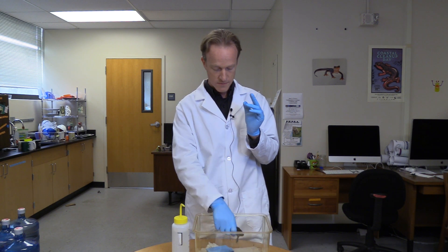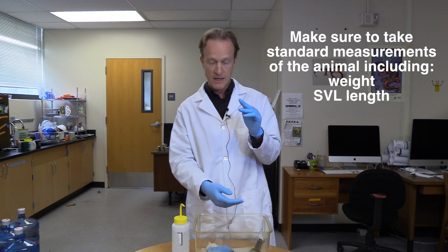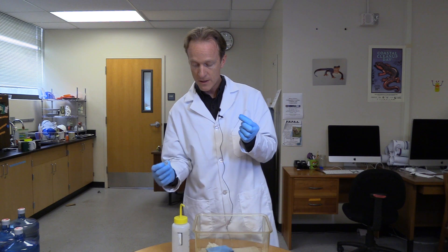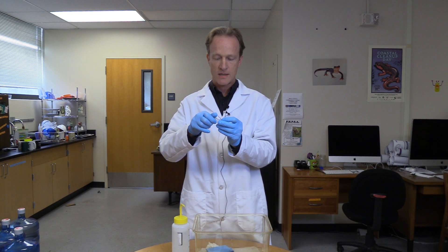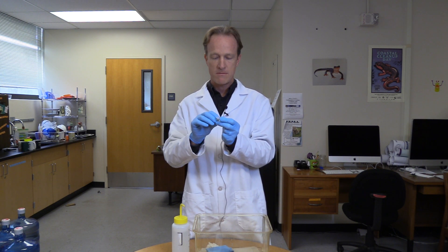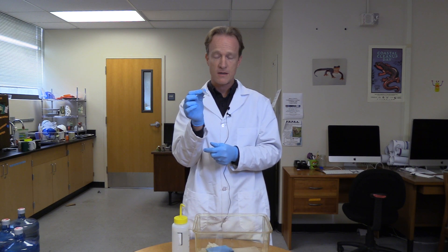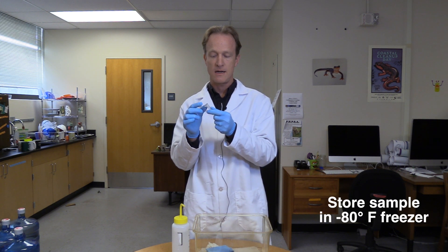Now my animal is ready to go. I would take standard measurements on the toad, like body size, body length, weight, that kind of thing. Then I take my sterile swab and, as quickly as I can, I put it in my vial. Wrap that up with the lid, and now I'm going to put it in a minus 80 freezer until we're ready to extract the DNA from this.